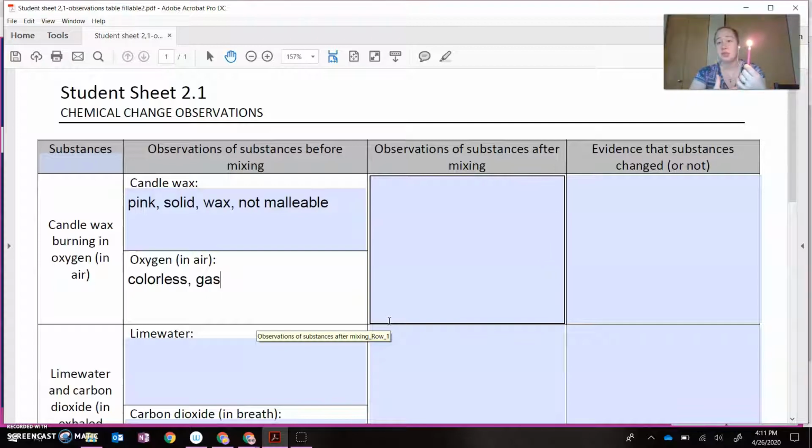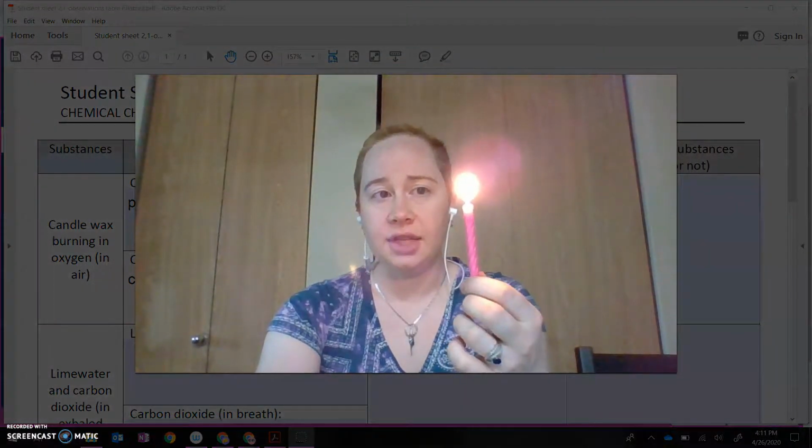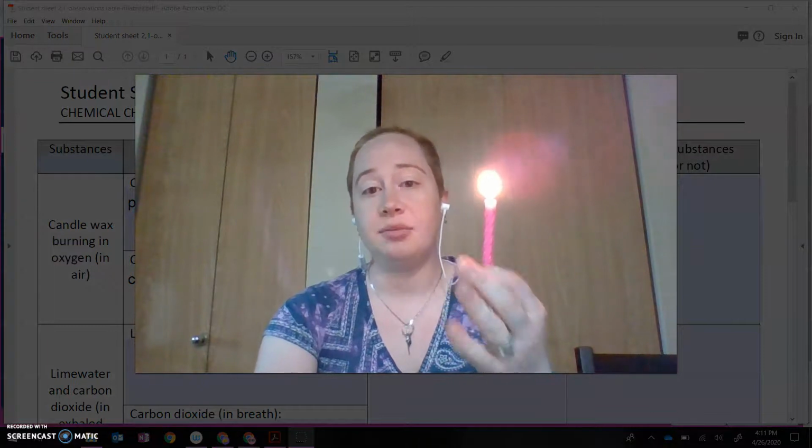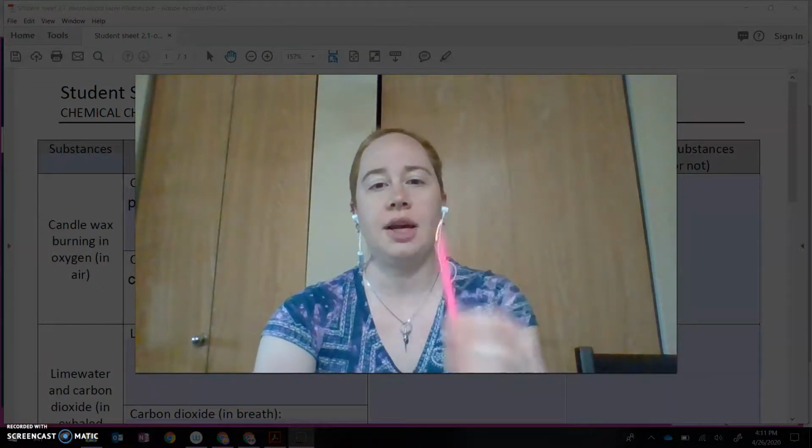Now, if we were doing this in person, you would need to make sure you're using all of your senses. What does it look like? What are you seeing? Are you smelling anything? Do you hear anything? Do you feel anything? Okay, so obviously if I were to put my hand right in the flame, we would feel some heat, but do we feel some heat coming off of the edges? All right. So then after letting it burn for a little while, I would then blow it out to stop the reaction from happening, okay? All right.